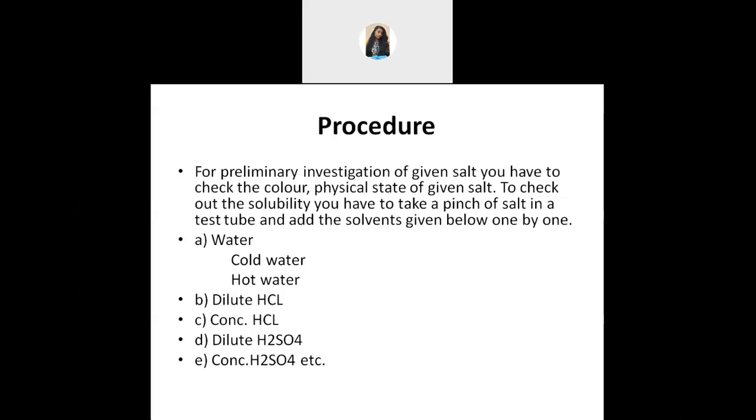If the salt is not dissolving in dilute or concentrated HCl, then you have to take another test tube, add the salt, and add the dilute H2SO4. Like that you have to add one by one. Got it?